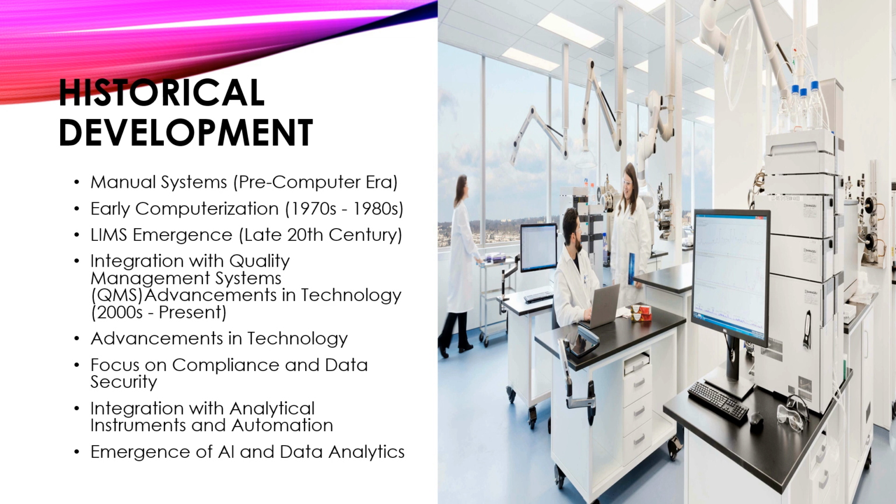Focus on compliance and data security. And in response to increasingly stringent regulatory requirements and concerns about data security, modern laboratory management systems prioritize compliance features such as electronic signatures, audit trails, and secure data encryption. And these features ensure that laboratories maintain data integrity and meet regulatory standards.